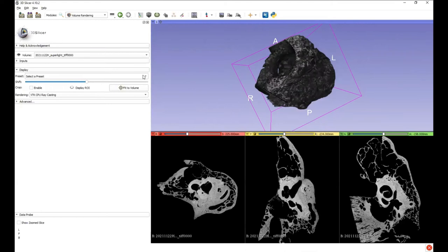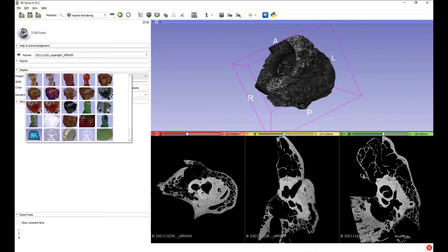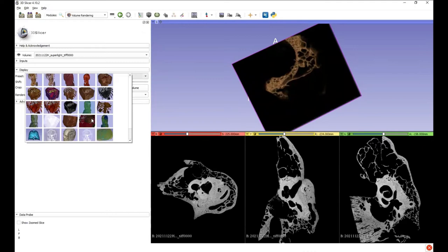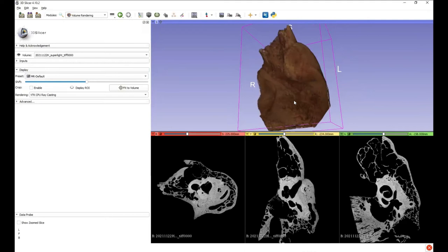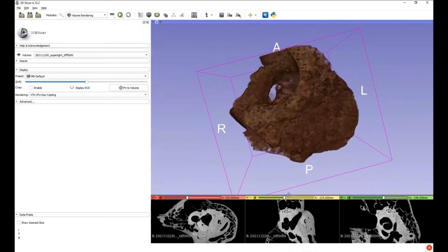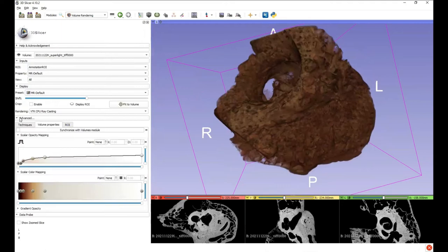Because it's a clinical tool, it has a few different default setups of pseudo coloring and selecting segmentation for visualization, which you can try. For some of the MRI images, some would be just spot on, and you can generate some beautiful 3D rendering. Let's just open this tool. There are a few different things you can do if you want to adjust the transparency or colors.